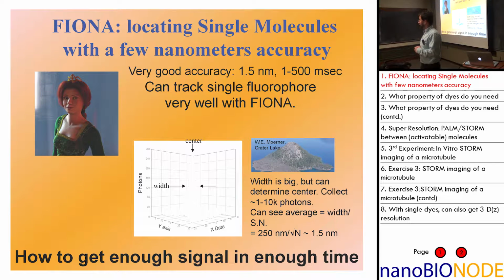They tend to die after a while, and that's particularly true of fluorescent proteins. So one way you can do it is to just add a bunch of fluorescent proteins, and as long as they are organized such that they move all together, it works out just fine.